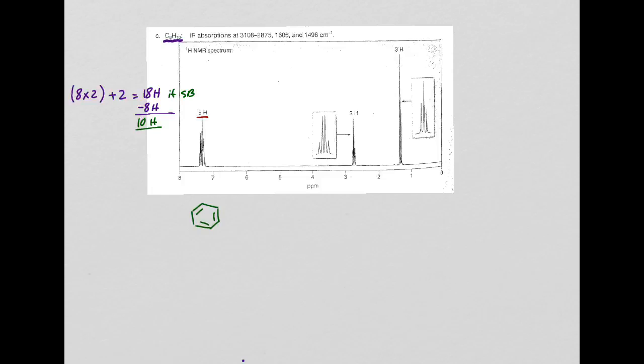When I look at the next peak, it's kind of downfield, 2.7, 2.8 ppm. That's interesting. And then it has 2 hydrogen, okay? So maybe I'm looking for a CH2. And then what's the splitting? The splitting, this one is nicely, you can tell, 1, 2, 3, 4. This one is a quartet. This one I'm kind of sure about. All right, so I have a CH2.